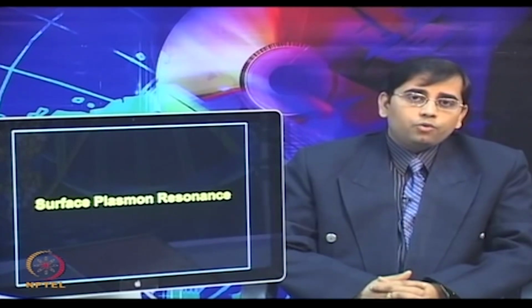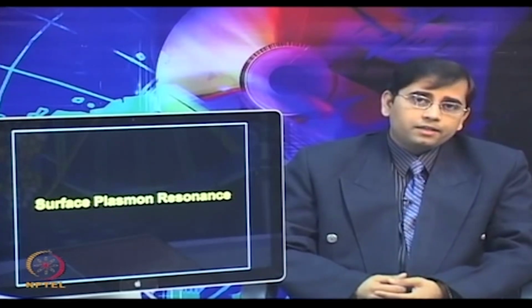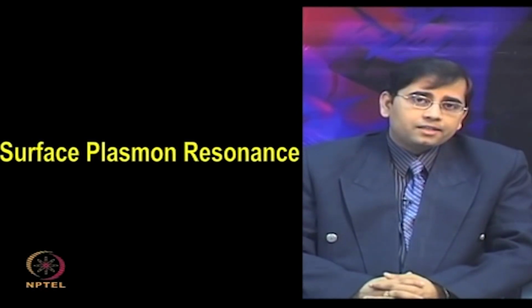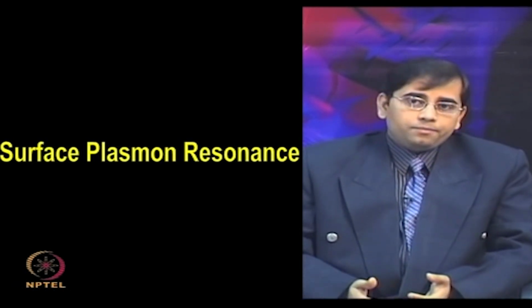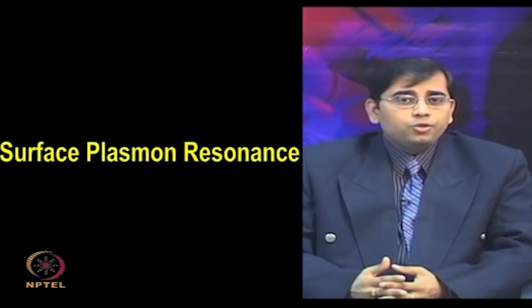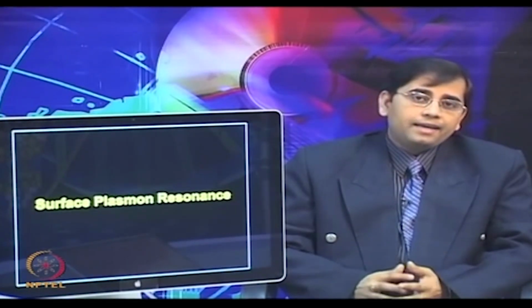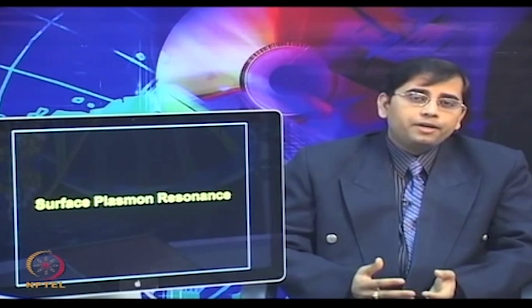This is one of the very efficient and emerging label free techniques for studying biomolecular interactions. Surface plasmon resonance biosensors are optical sensors which exploit surface plasmon polaritons, the surface electromagnetic waves that can propagate parallel to a metal or dielectric surface. SPR is used to probe interactions between an analyte in solution and a receptor that is attached to the SPR sensor surface.